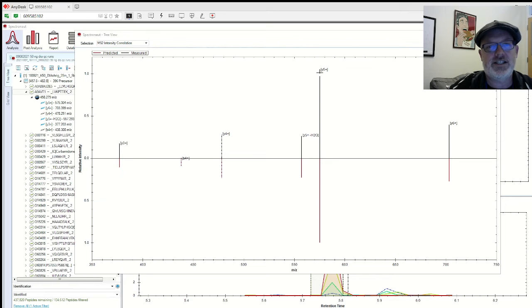So the difference between these angles between 5 and 6, people call this a spectral angle. So we know the deep learning prediction, for example, if you look at Y5 and Y6 fragments, should have an angle associated with their apexes, I assume. And that angle should match what we see in our mass spectrometer. So for example, we're predicting Y6 is less intense than Y5.